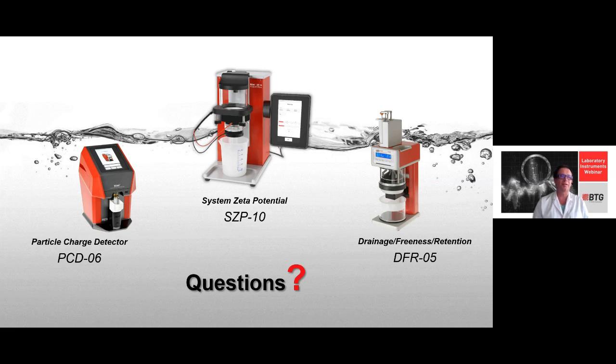It does clean a lot, including, like you mentioned, residual polymers that you have done from such a chemistry test. And even more important, besides chemical solving, is mechanical cleaning. So by using a piston brush and really rubbing the surfaces, the inner surfaces of the measuring cell clean.